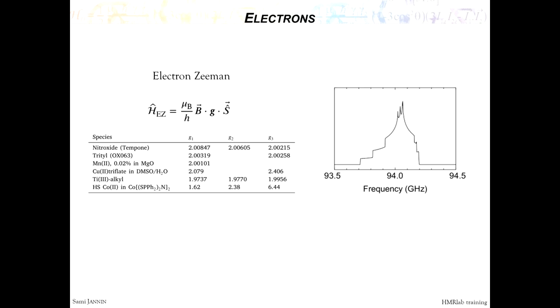Each frequency corresponds to certain spins that have the right orientation. So if you irradiate somewhere, you will only hit a few spins that have the exact perfect orientation, and that sit at this frequency.